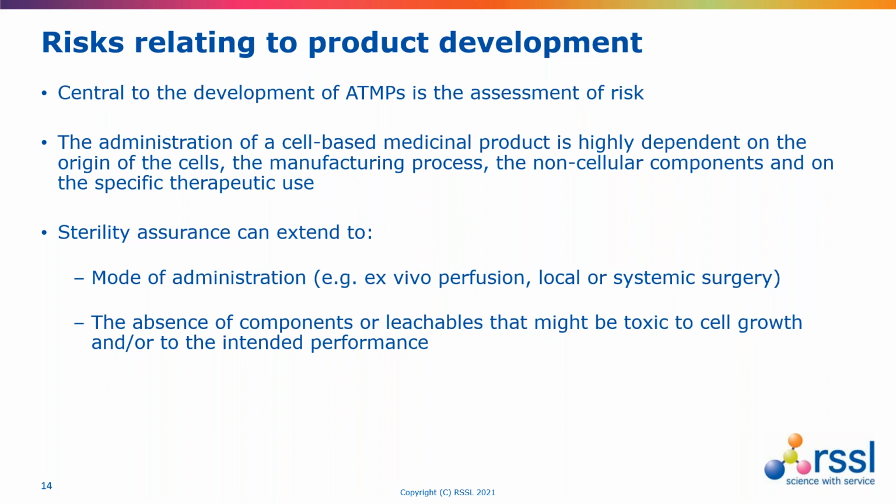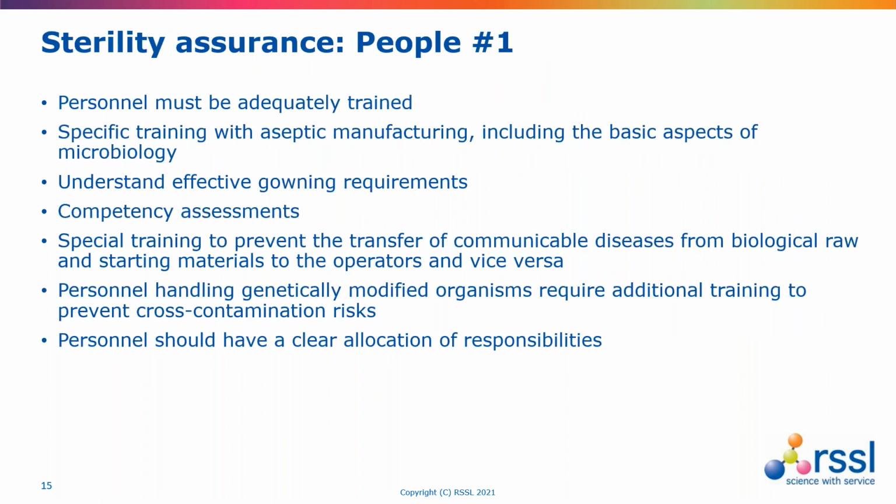Okay, so moving on to some more sterility assurance specifics. Always at the top of any sterility assurance concerns comes people. So it is important that people are adequately trained, and in particular personnel working in clean areas should have a good grounding in aseptic manufacturing.